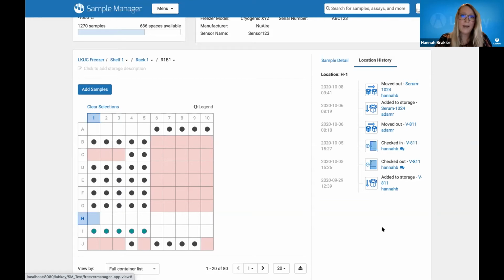Like, what's happening? This will allow you to view, was it ever even added to this system? Do I need to go and check? Had it been moved? Is it somewhere underneath a freezer somewhere? What's happened to that? That really gives you a glance into that specific location.